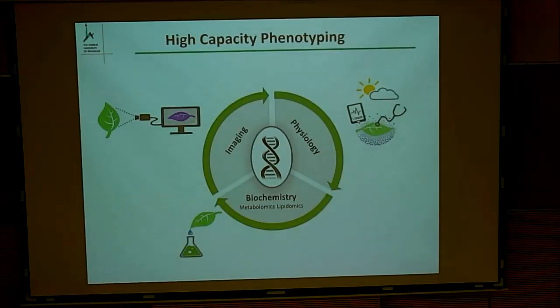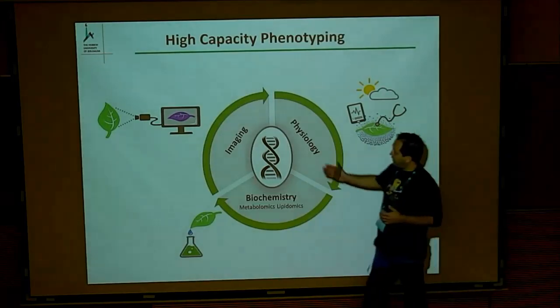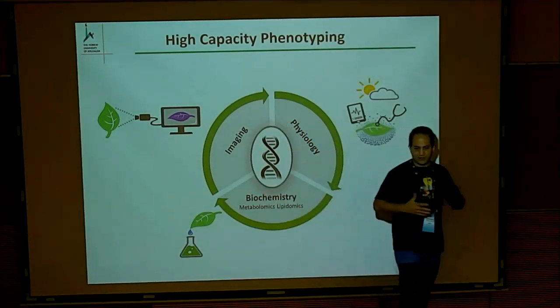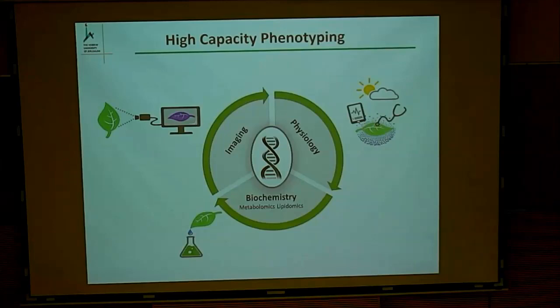So phenotyping today is a major issue. It's growing all the time. And the main phenotyping that most of the people know are the imaging and metabolites. So you just take some kind of pictures of your plant in a hopefully high throughput manner.